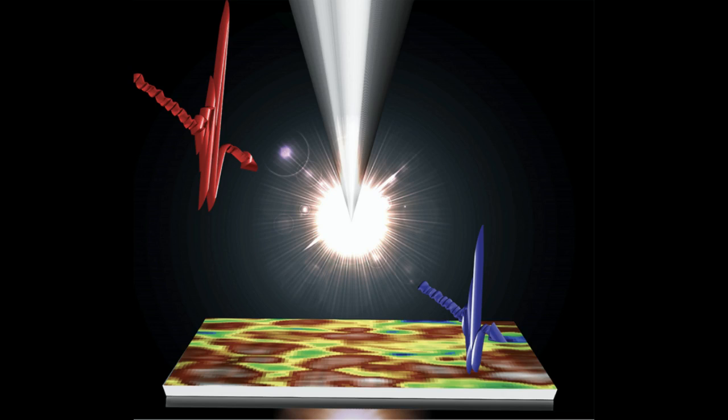Normally, if we have a light wave, we cannot see things smaller than the wavelength of the light we are using. And for this terahertz light, the wavelength is about a millimeter, so it is quite large. But here, the researchers used this sharp metallic tip with an apex that is sharpened to a 20 nanometer radius of curvature, and this acts as an antenna to see things smaller than the wavelength that they were using.